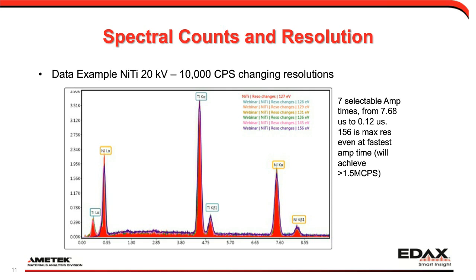I've got a couple of questions in the meantime, and so until we get our video back, I'll take a question, and it looks like we've got a question about the count rate. And so the question is, what should be the minimum counts per second to obtain reasonably accurate results?